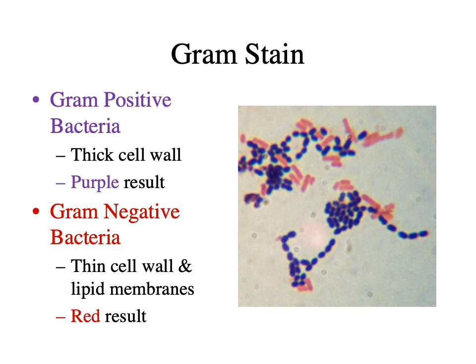Because that crystal violet has not formed a complex, there's not enough peptidoglycan in that cell wall, and because the decolorizer has poked holes in the membranes, all the color washes away. So you counterstain this now clear cell with safranin, and when you're done with that process, it shows up red. So gram-negative bacteria will be red. Gram-positive bacteria will be purple.